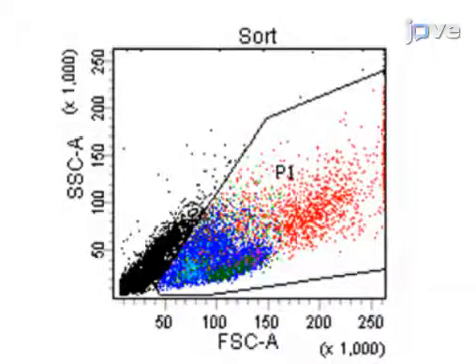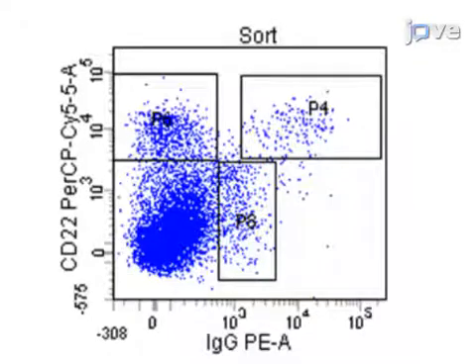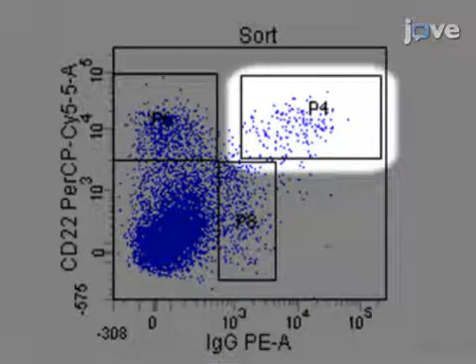After staining CD22 and IgG positive, PBMCs were sorted by FACS. The area of the double positive cells, B cells producing IgG antibodies, was collected separately for expansion. About 1% of the PBMCs were in this double positive population.